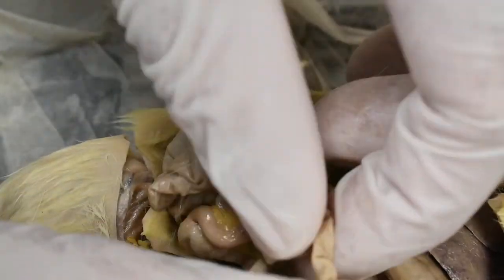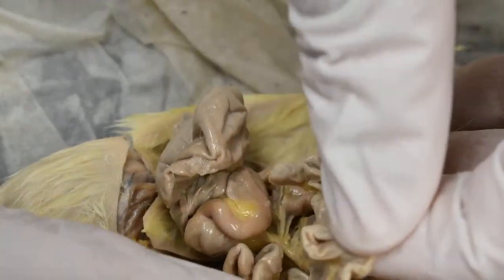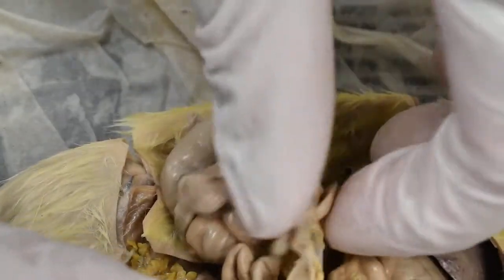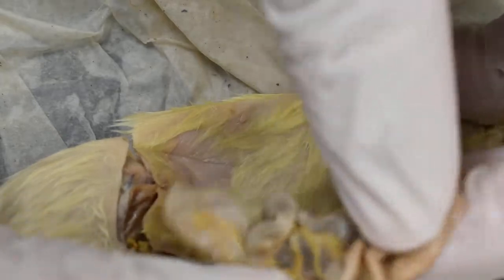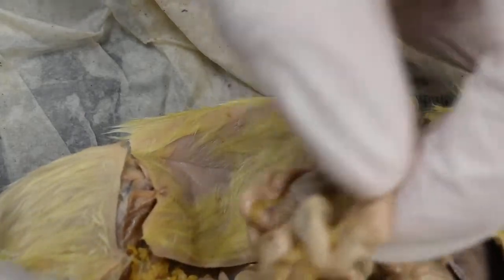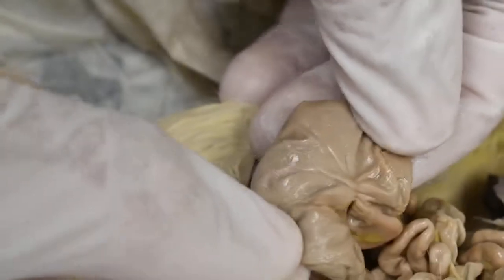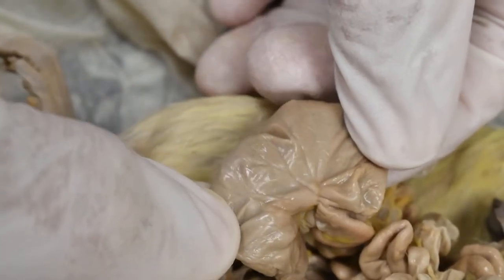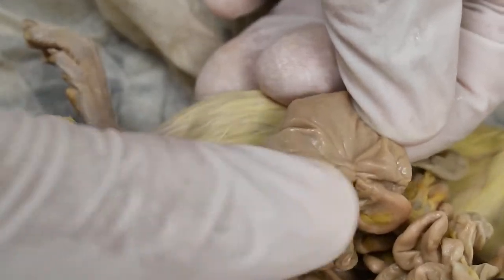So at some point, you sort of follow this along. So at some point, it does become ileum. All right, where exactly, we won't worry. But eventually, you come down here. See, that's really long compared to other organisms we've seen. You come down here, and then there's this big sac. So you see that people see this and they think, oh, that must be the stomach. No, that is a division of the large intestine.